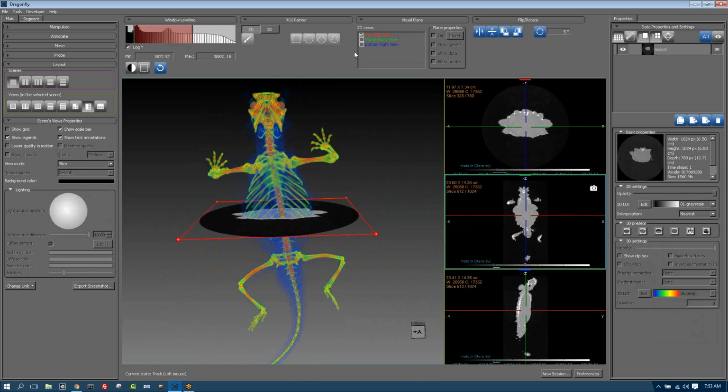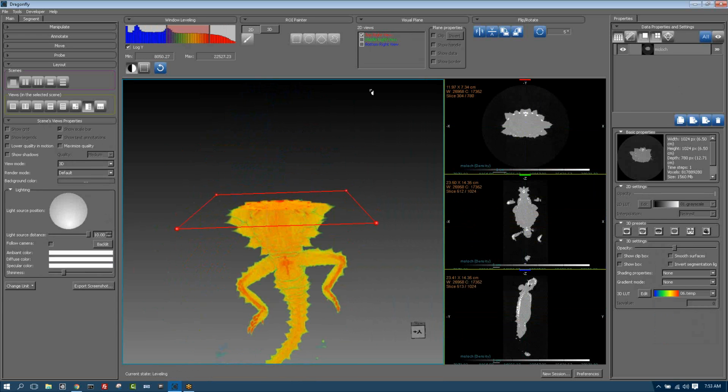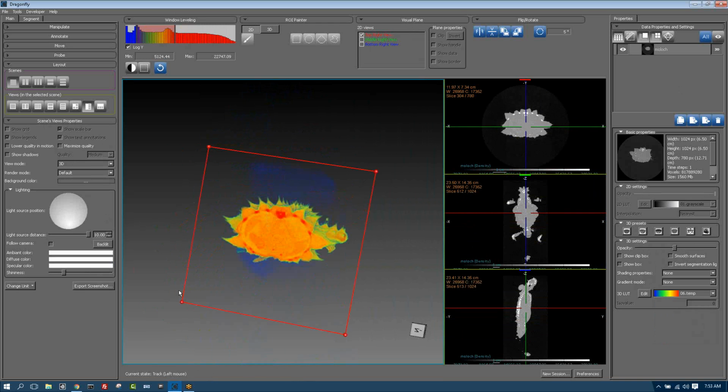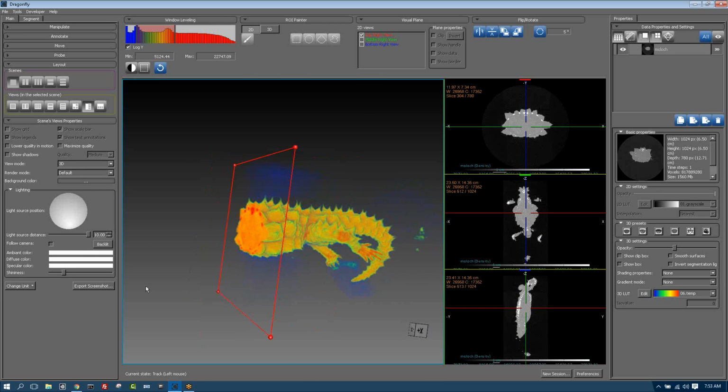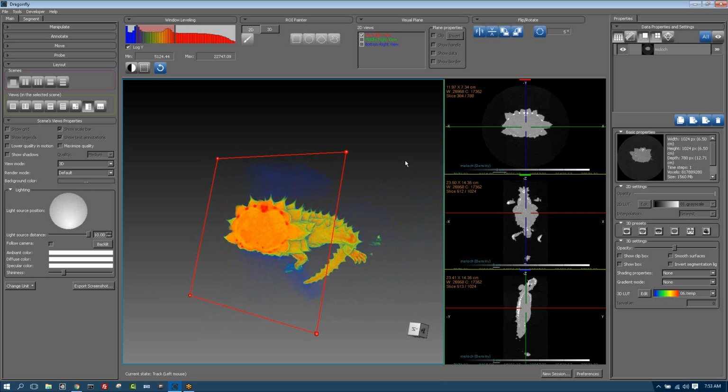So you could do that for different views. You could also, once you choose this view, tell it to not show the data, but just show the position. So you have some other attributes. You could tell it to do some clipping. So now if I have a 3D rendering with some solid rendering, and I want to apply a clip plane, I can do it that way. Now, these views which you see are right now all orthogonal, but it's very easy to make them oblique.